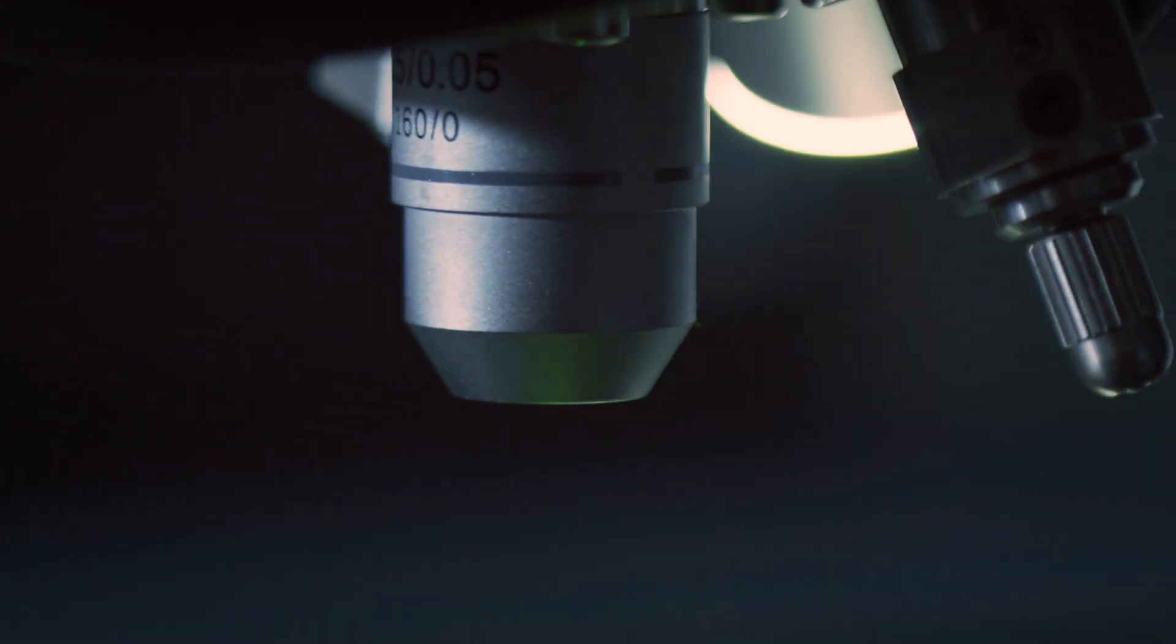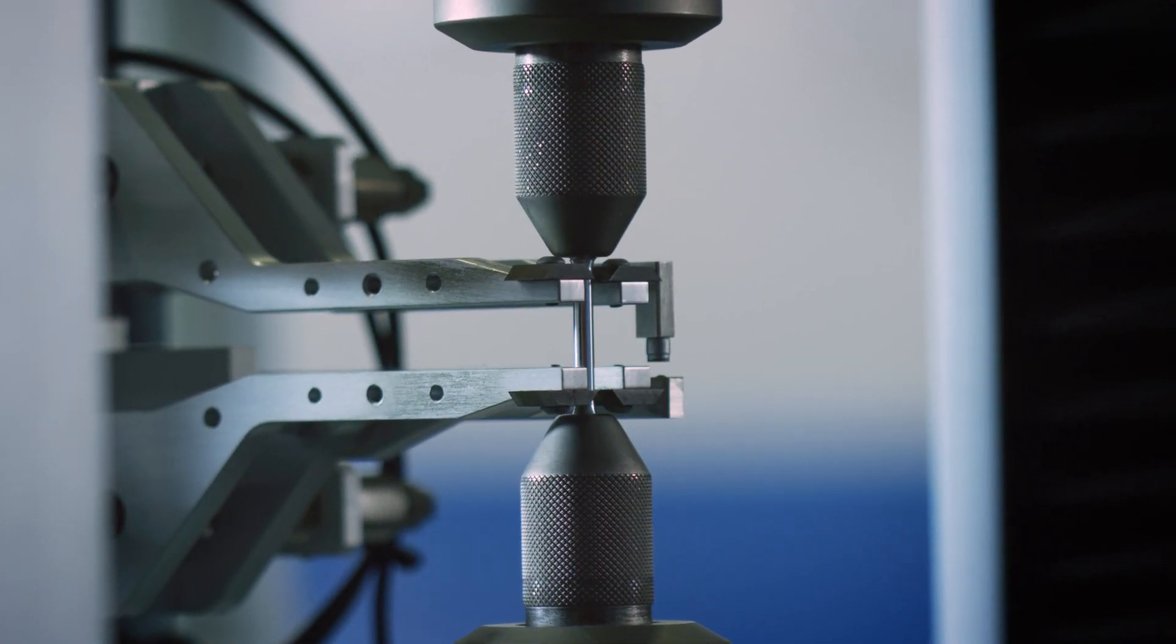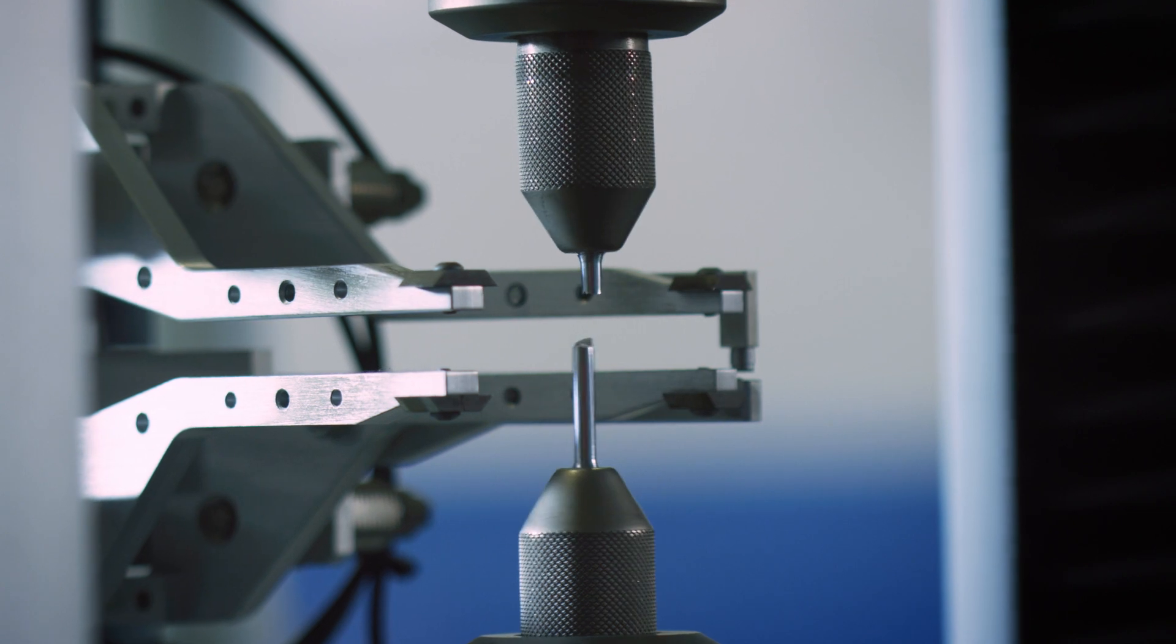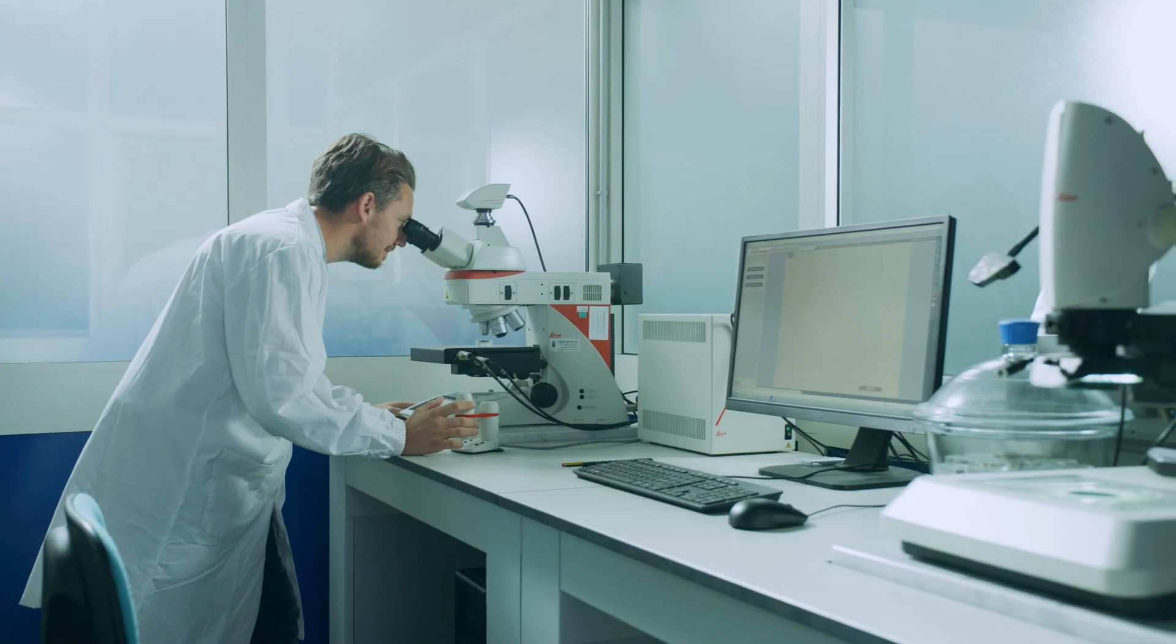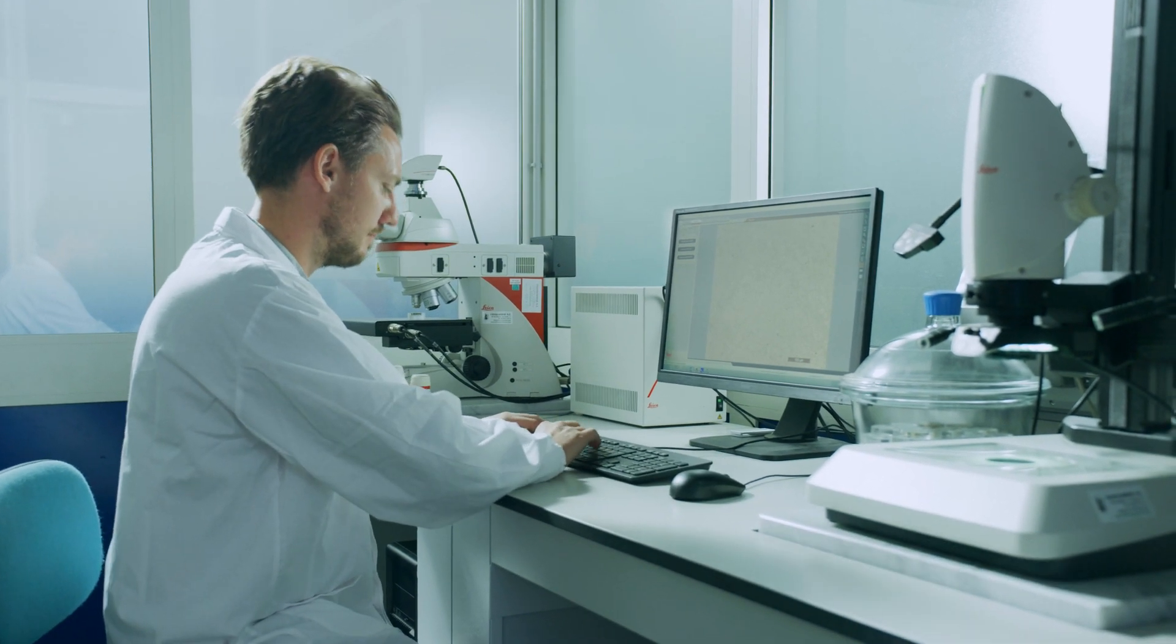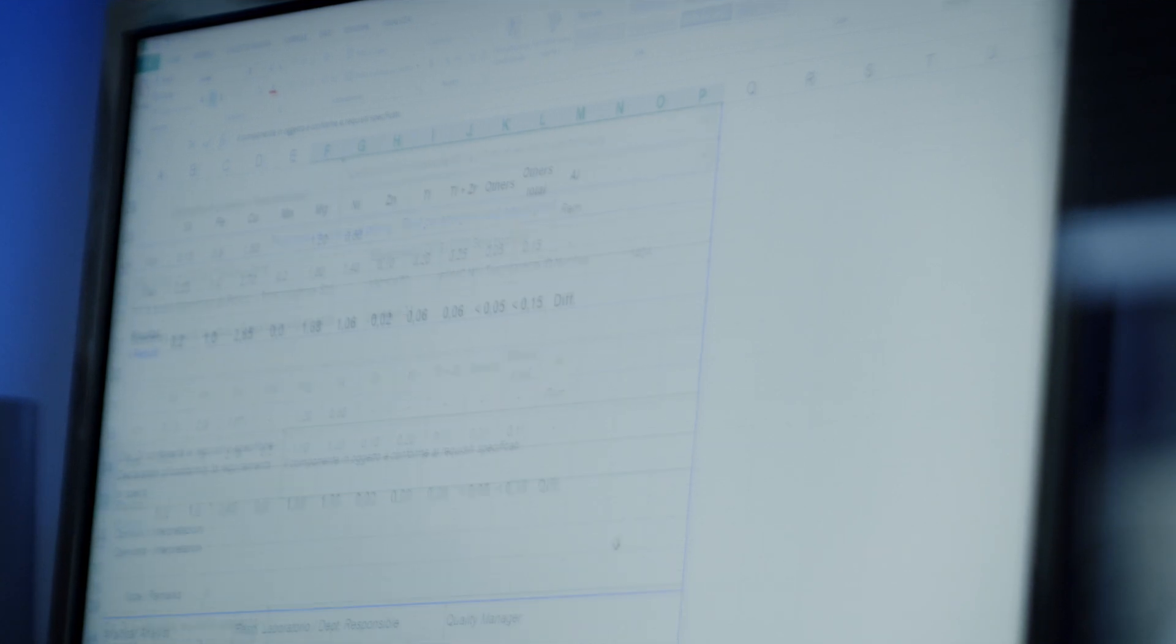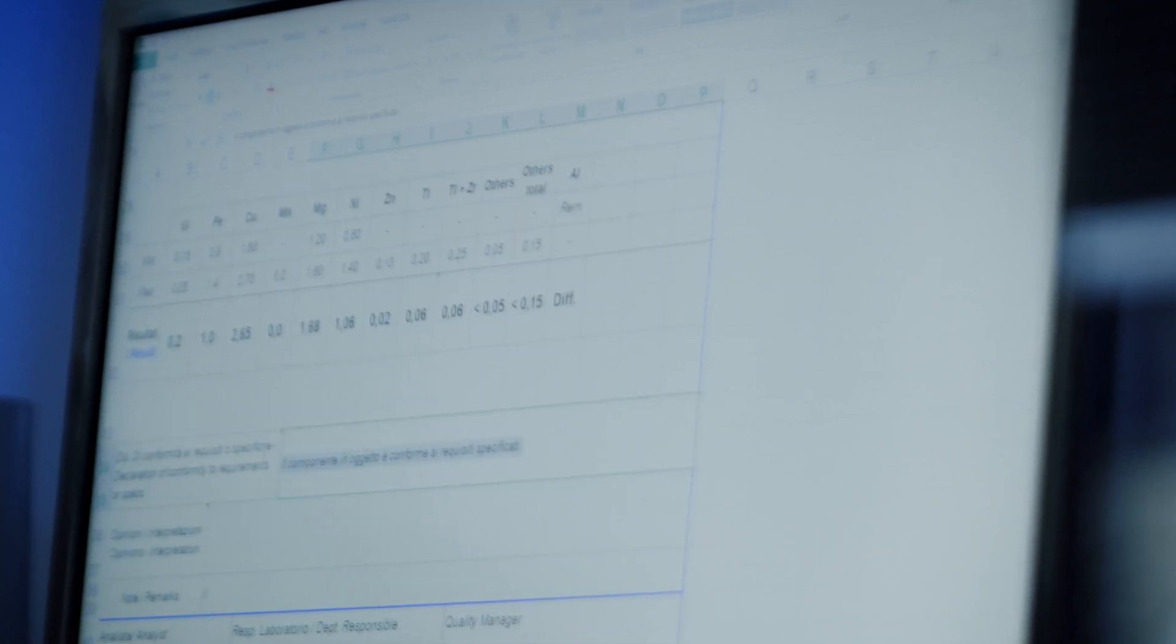constant monitoring, micro and macro analysis, and de-zincification, the Metallurgical Laboratory is able to define compliance with specific requirements, perform studies aimed at continuous improvement, and verify any product returns or claims.